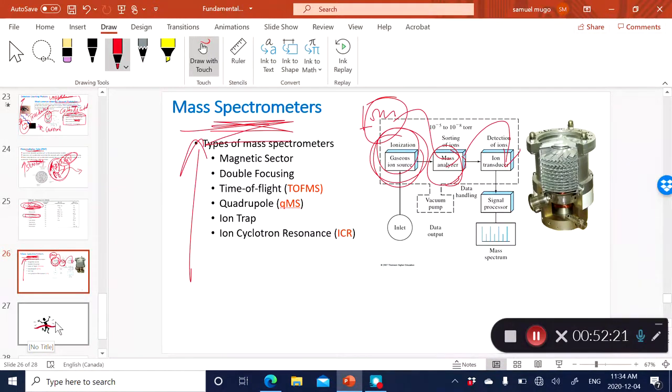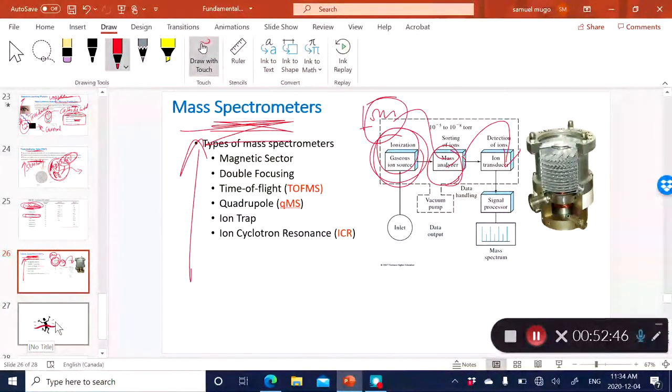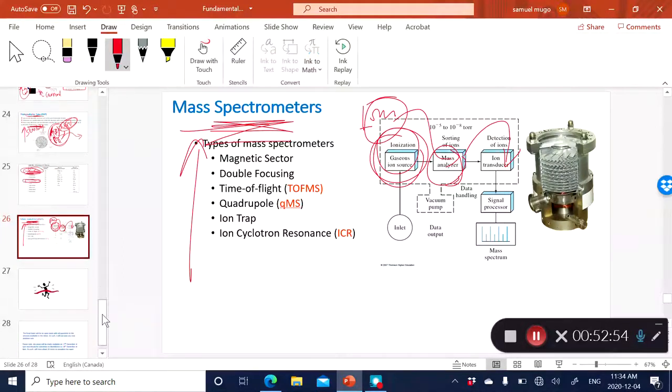So that's all that I'm gonna say about spectrometers. And I hope I've clarified the basic theory behind the spectrometers and the different components that are present in absorbance spectroscopy, fluorescence spectroscopy, and phosphorescence spectroscopy, and of course chemiluminescence, which doesn't have a light source again, because the light is purely coming from a chemical reaction. And so that's all that I'm gonna say about spectroscopy.